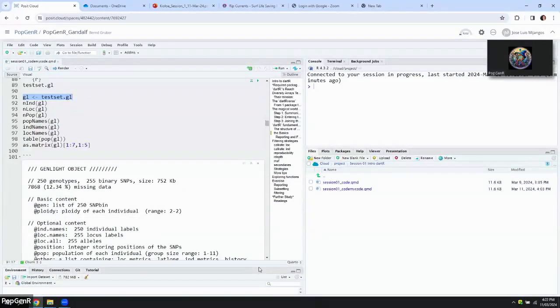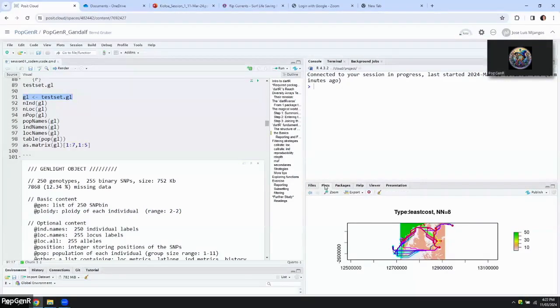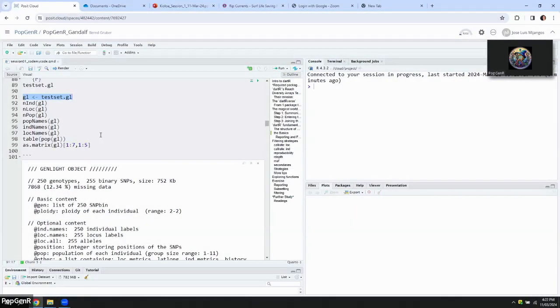Yeah. So basically, you're treating it as a binary character. So you're getting 0, 1 or 2. And if you want to work out what the character state change is, you can look at the actual SNP itself at that locus for that individual, and you can see what the actual change is.